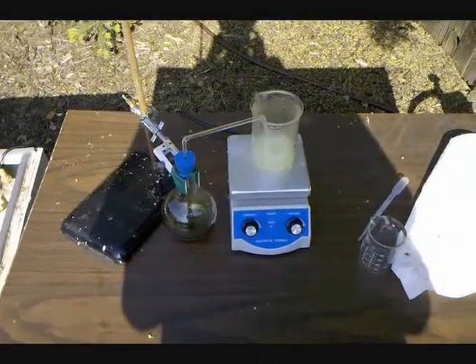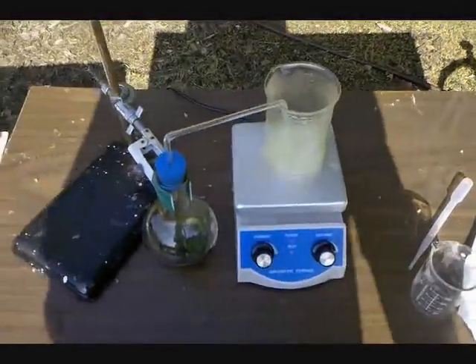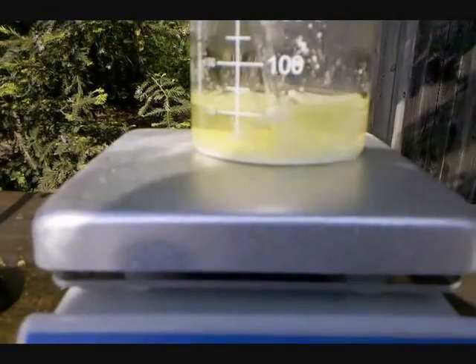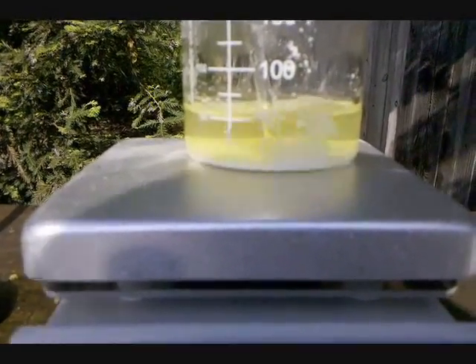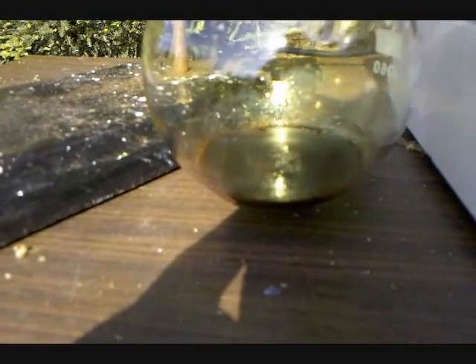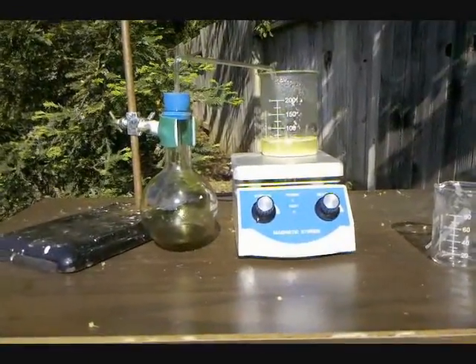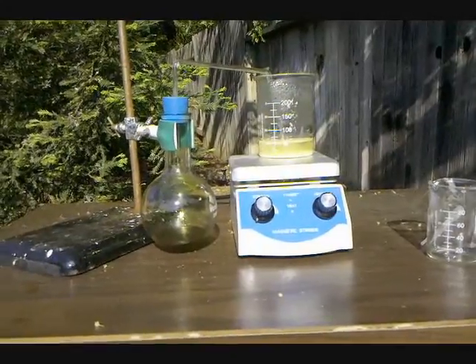We are about 50 minutes into the synthesis. At this point, we can see a pretty dense white precipitate on the bottom of the beaker. I've had to add hydrochloric acid again twice to the chlorine generator, but everything seems to be going well. I'll stop it in about 10 minutes.